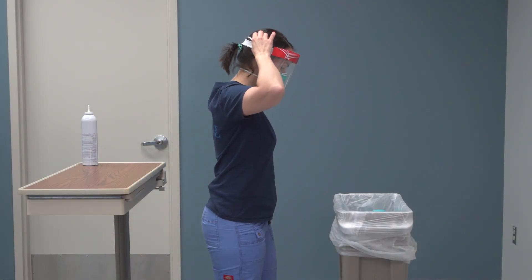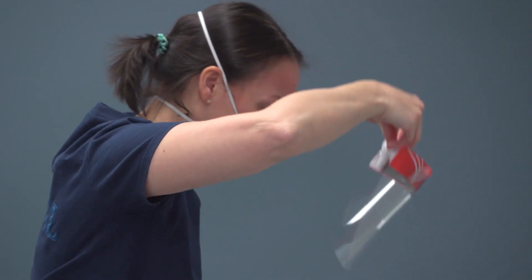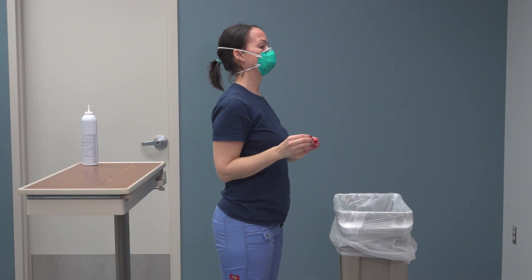Remove face shield. Leaning forward, grasping the elastic band, remove in a slow, controlled manner, and place in the receptacle in room.